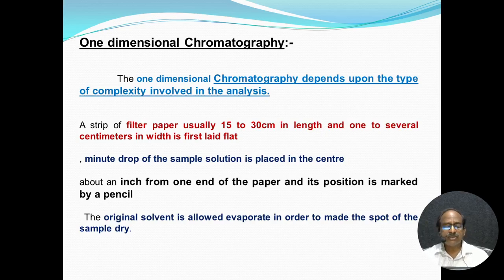Another important type in paper chromatography is one-dimensional paper chromatography. It depends upon the type of complexity involved in the analysis.